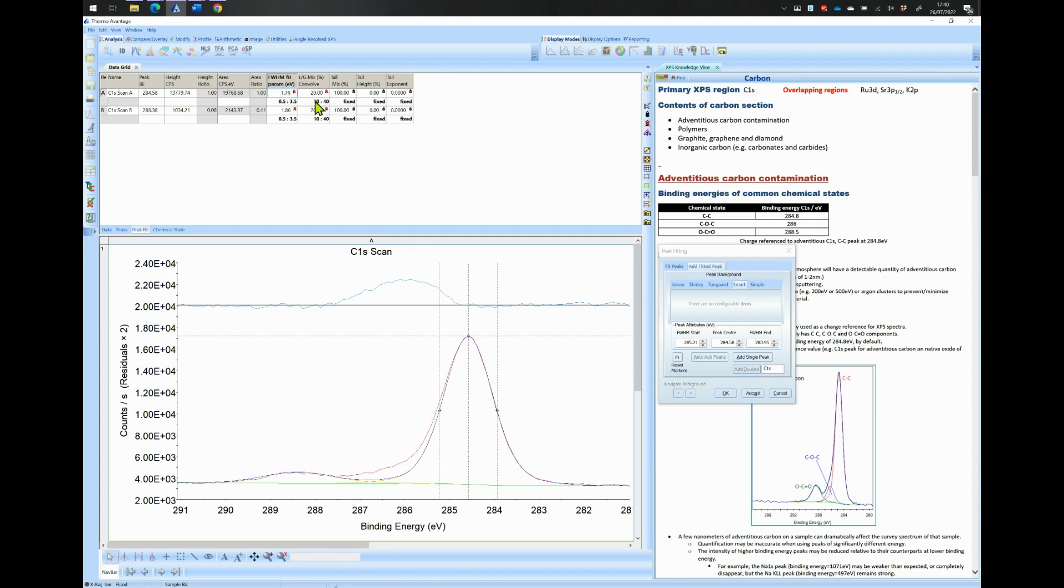In the case of Carbon 1s, only the SP2 carbon type will be below 1 eV. The SP2 carbon is not present in this example.